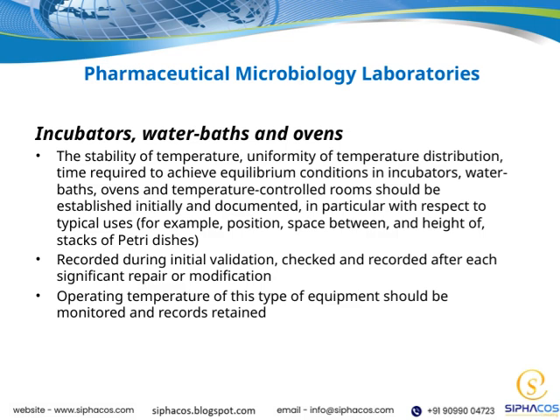Regularly monitoring the operating temperature is vital, and all records of these checks should be retained for compliance and traceability. In pharmaceutical microbiology laboratories, maintaining precise and consistent temperature conditions is fundamental. It guarantees the integrity of your experiments and the accuracy of your results.